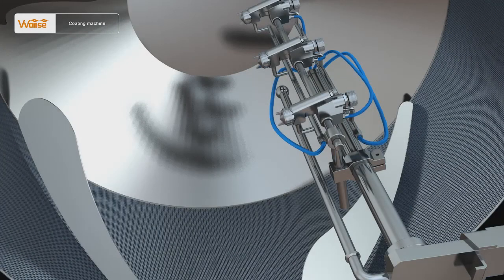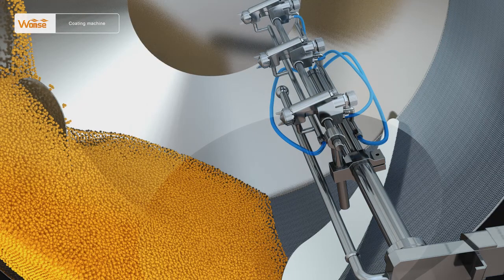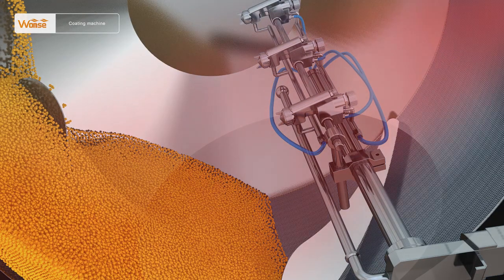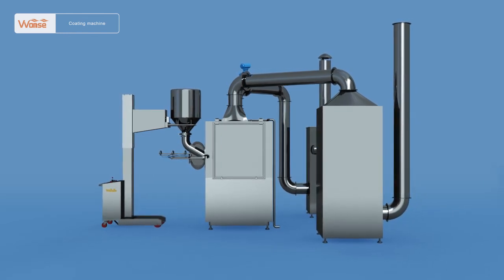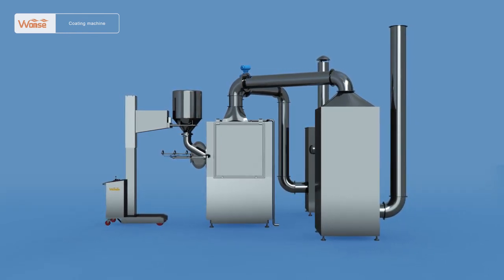Coating process. First, the feeding amount of tablets or pills to be coated in each batch is from 65 to 150 kg per port. The tablets or pills to be coated can be fed into the coating drum through a mobile lifter.